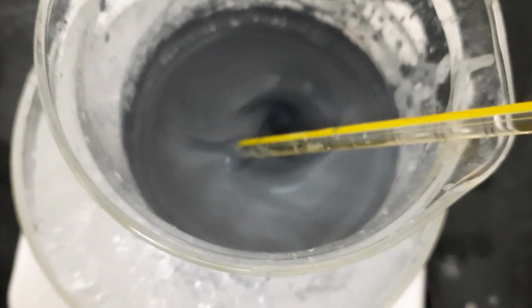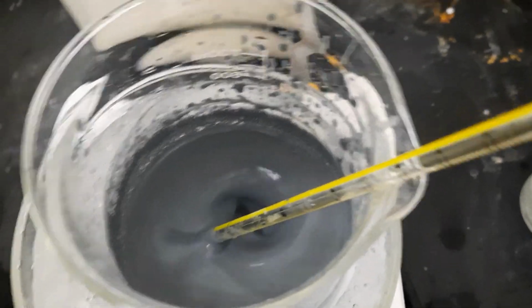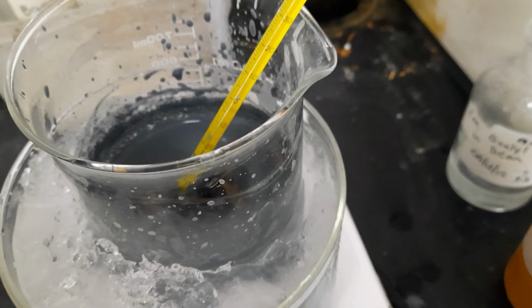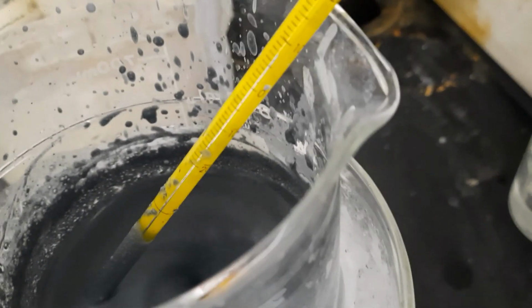And you put that into glacial acetic acid that you diluted, so I guess just regular acetic acid, and you continuously add in more of the zinc and nitroguanidine mixture and ice, and you make sure it's cooled to between 5 and 15.